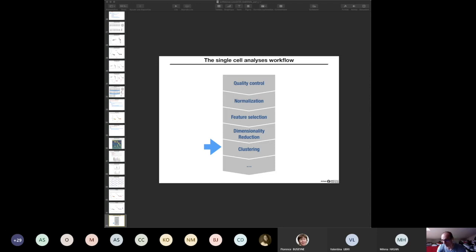And as Bernd is saying, it also depends on the biological question. If your sample has cells that are going to be very different, for instance coming from a brain region where you get neurons, different types of neurons, and glial cells of different types, then choosing just a few genes will be enough to separate the big cell types.